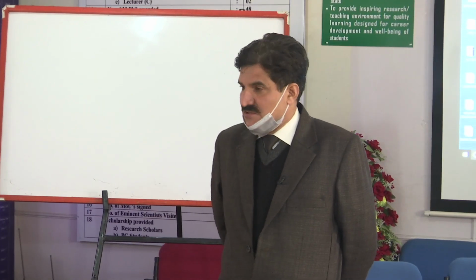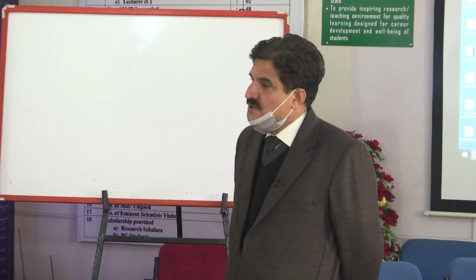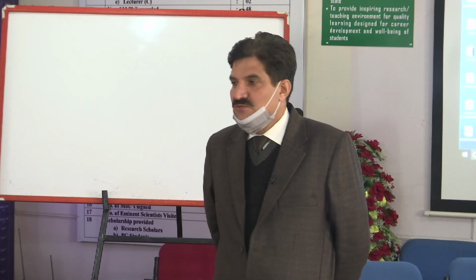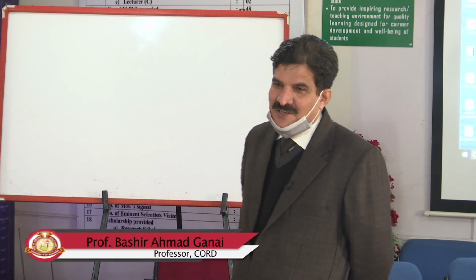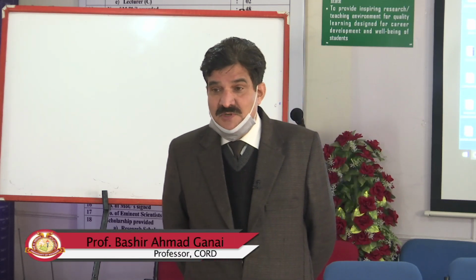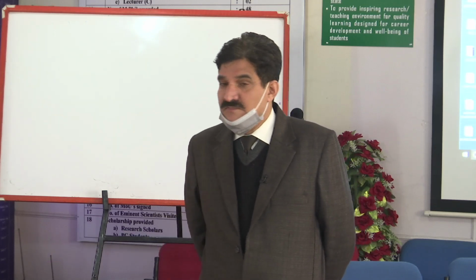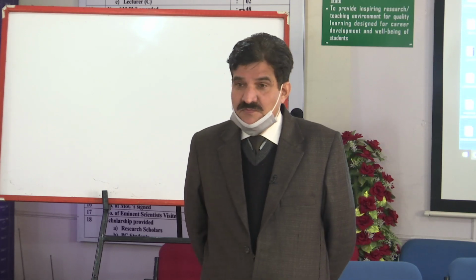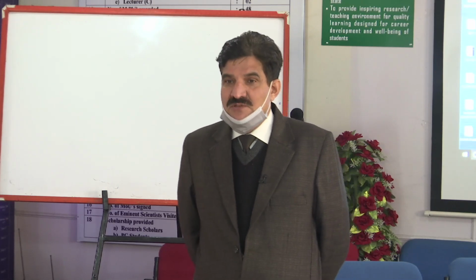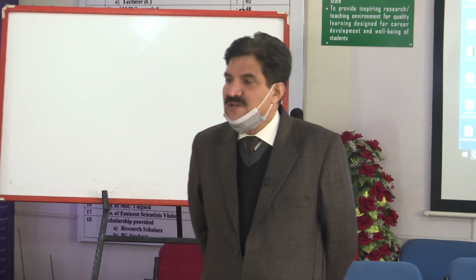from 2 to 3 hours. The experimental part we are performing in 2 to 3 hours. It is a job of 2 to 3 hours. Sometimes an overnight process is required. But I will provide you such a method, a little bit modified one, modified through practice. So that is costing about 2 to 3 hours, and in a single day you can isolate DNA from any tissue.